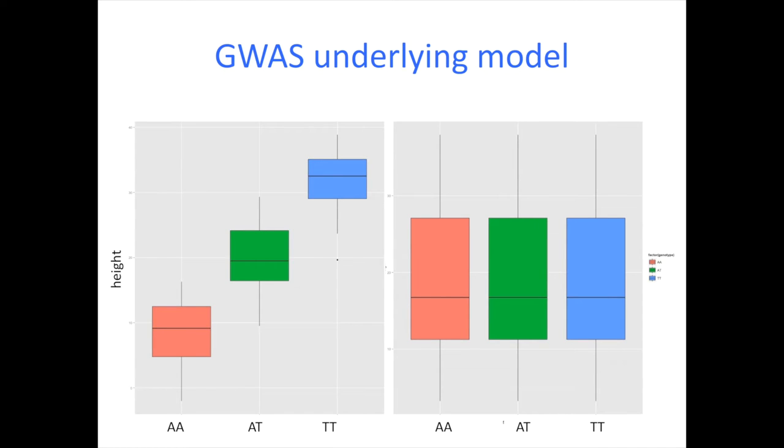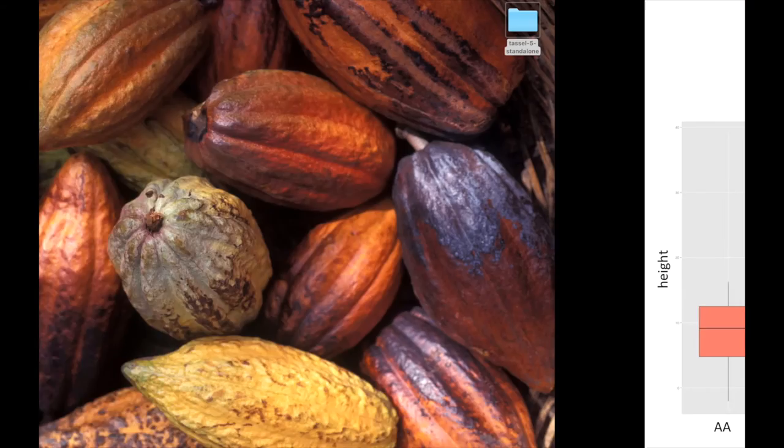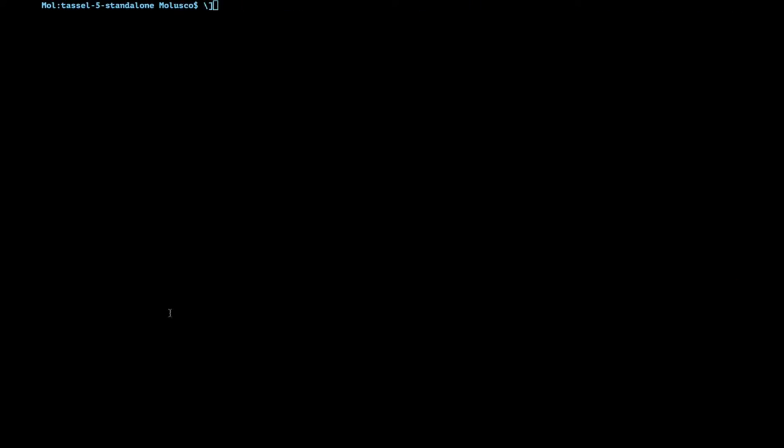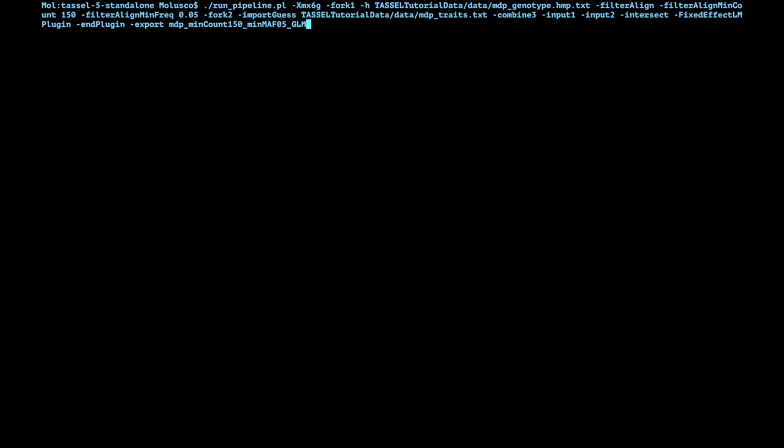So let's go ahead and do that. Here we have a terminal and here's the command that you're going to be running. I'm going to walk you through what this all means and then we're going to see the effect. So there were two of them. The first one starts with start_tassel.pl. This means that after we run this command the user interface is going to be started.